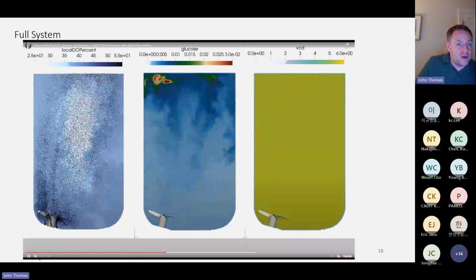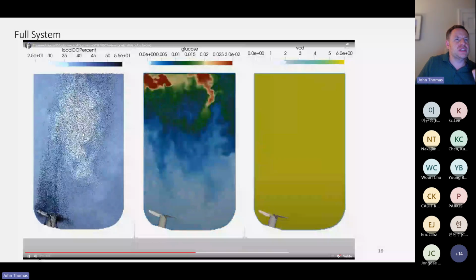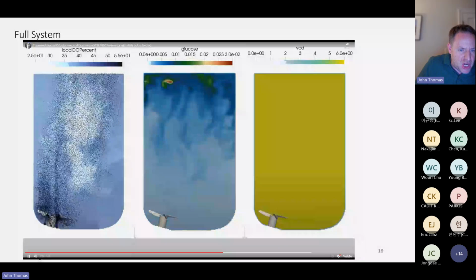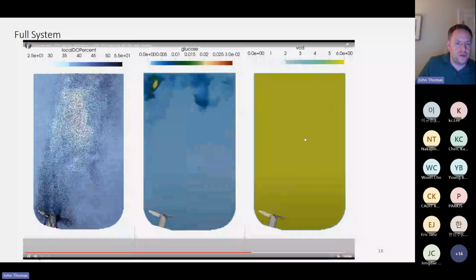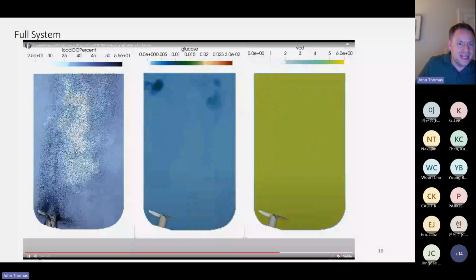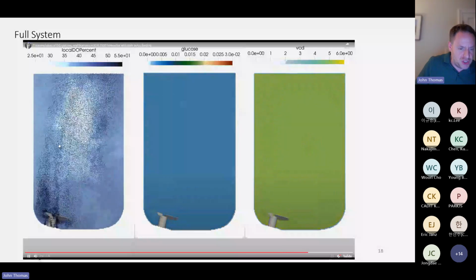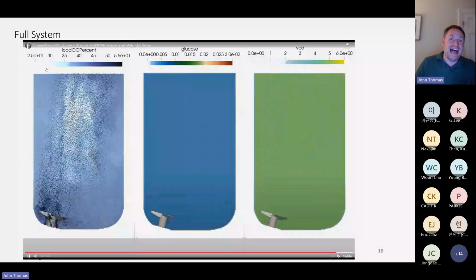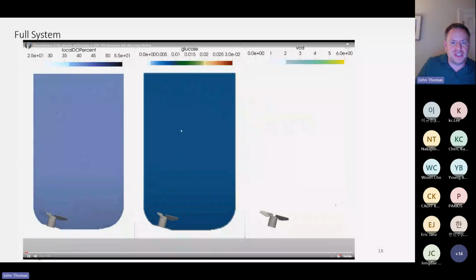But look at this. When our oxygen transfer rate is maximized, here again we see those dead zones. Dead zones are notorious in these single-use bioreactors. But importantly, we can see the formation of that dead zone, the persistence of the dead zone, and how that dead zone ultimately informs cell growth. And we can also see how the PID parameterization informs the dead zone. So again, here is the time evolution of the DO field in response to the oxygen demands, the changing gas flow rate due to the PID controller that's modeled in line with the cell growth kinetics and this operating vessel.